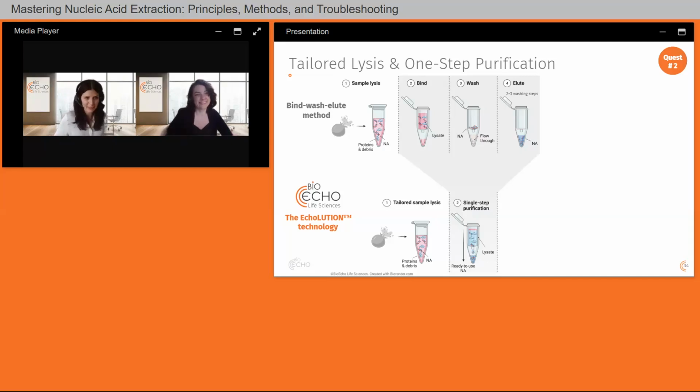Yes, we can. Why can we do this? Because it's a column-based method, you can automate it. What you can start with is a liquid handler, because it's then just transferring liquid, a kind of semi-automation, and then you take your plates out and put them in a centrifuge. If you don't want to do this, there are also liquid handlers. We are working, for instance, together with Hamilton.